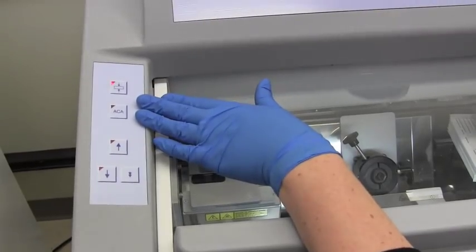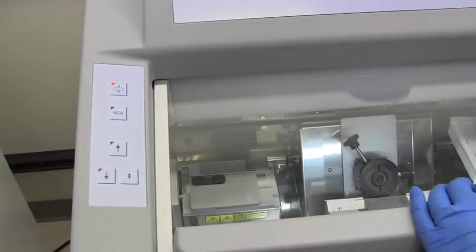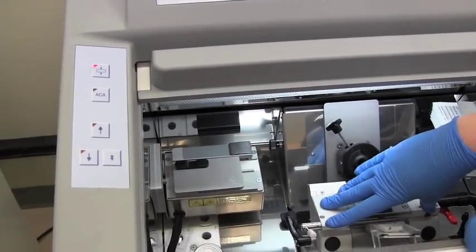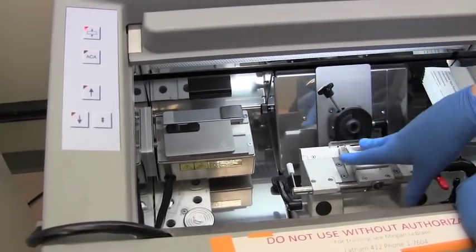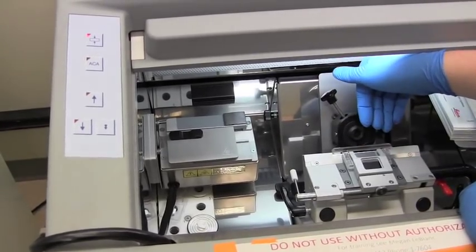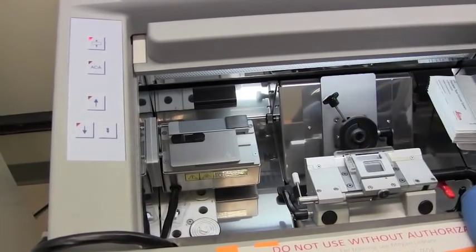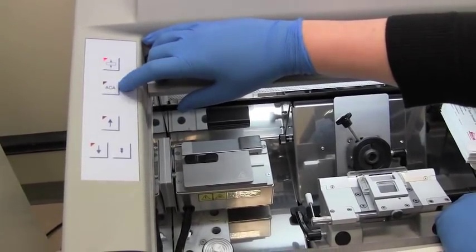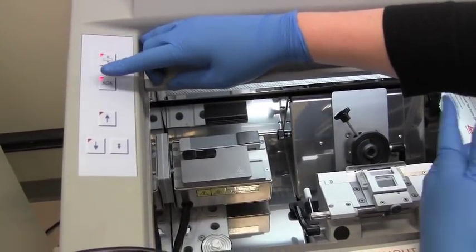The buttons on the side here control the carriage moving forward and backward. So this is what's going to move forward. The actual blade holder isn't going to move. This is what's going to move towards the blade every single time you cut. So you can advance it manually using this automatic advance button. If you push it, it'll automatically approach.